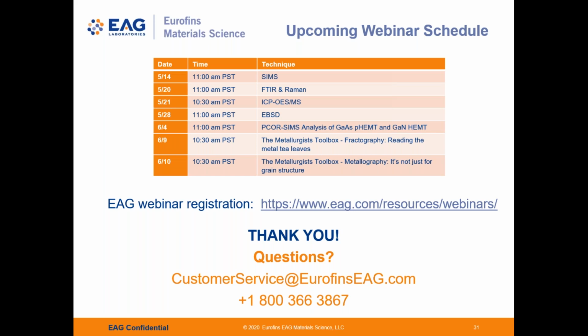I would like to extend a little bit on this question. SIMS can measure ppm level, and if we complement RBS with SIMS, we can measure the matrix elements as accurately as possible. Then SIMS can measure ppm level contaminants or ppm level dopants more accurately if they have very accurate matrix information from the RBS. So we can complement the RBS technique with SIMS, which is a very powerful combination which we use for a lot of the clients, right? That's correct. Yes, that's right.